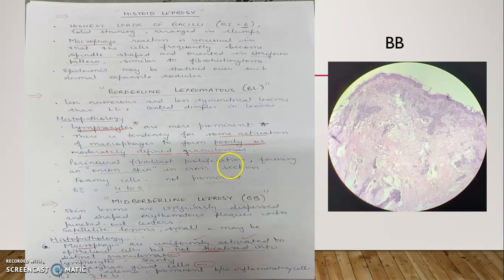Perineural fibroblast proliferation is seen forming onion skin in cross section. BI is 4 to 5. Foam cells are also not prominent. So lymphocytes are prominent along with some activation of macrophages.